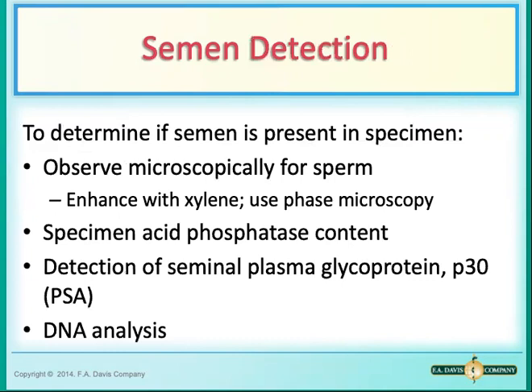Okay. And one last thing to mention is that sometimes we want to do a post-vasectomy semen analysis on certain samples. The post-vasectomy semen analysis is a much less involved procedure compared with infertility analysis, because the only concern here is the presence or absence of the sperm.